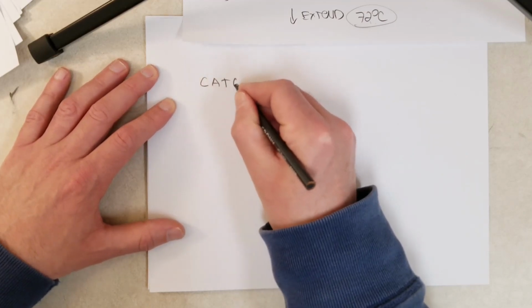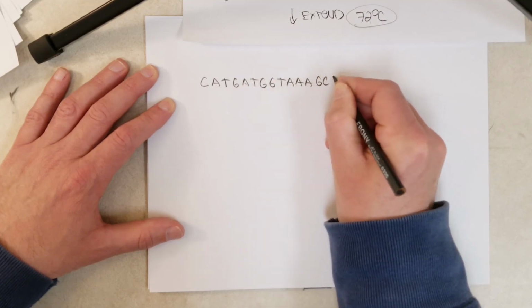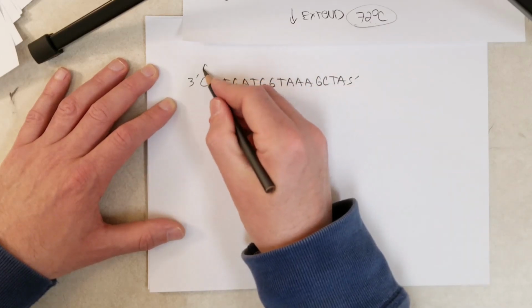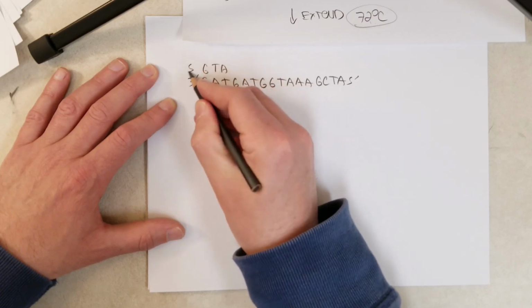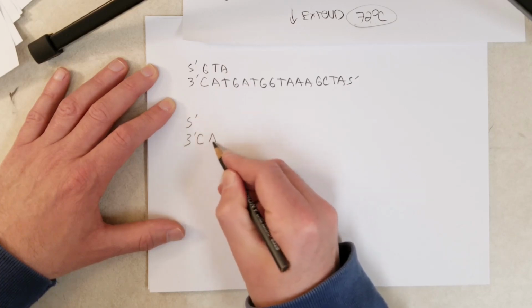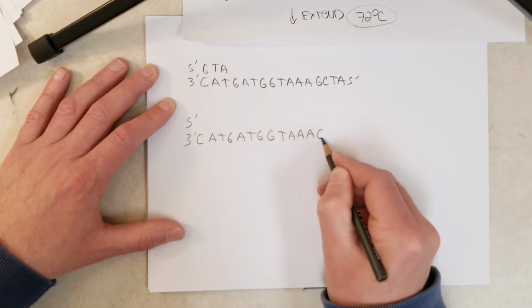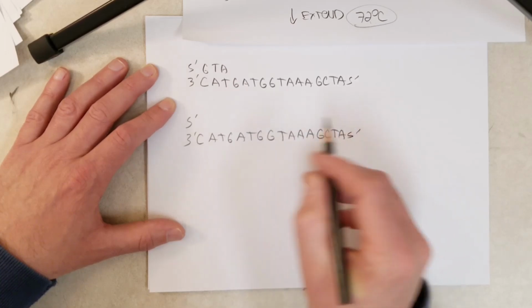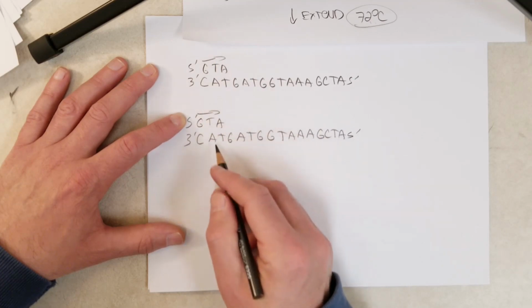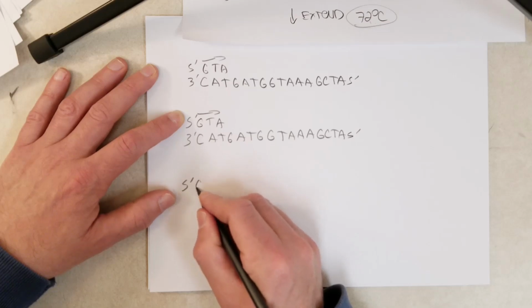So remember, the test tube has many copies of the template, say thousands of copies of the template. And we made them all single-stranded by denaturing. And when we annealed all of them, we assume all of them have the primer annealed to the primer binding site. So let me diagram just 3 copies of the template. And now notice how I'm not diagramming the top strand of the template, right? Because we don't care about the top strand with sequencing, because we only added 1 primer. And this primer only binds to the bottom strand. So the top strand's floating around in the reaction and it's not really doing anything.